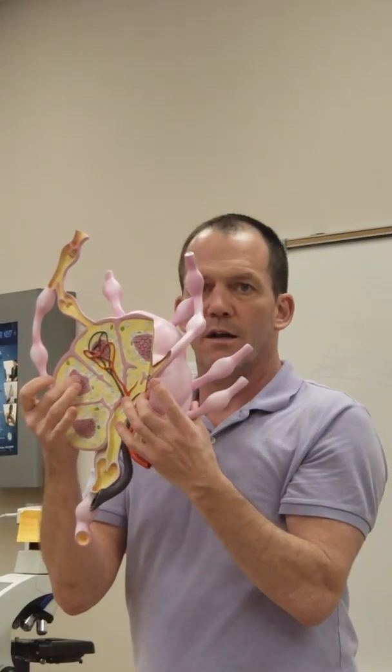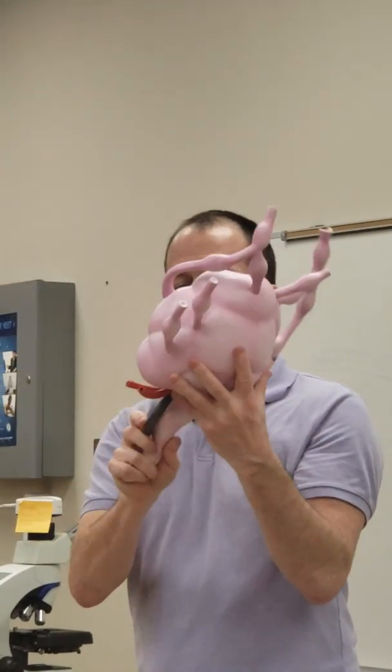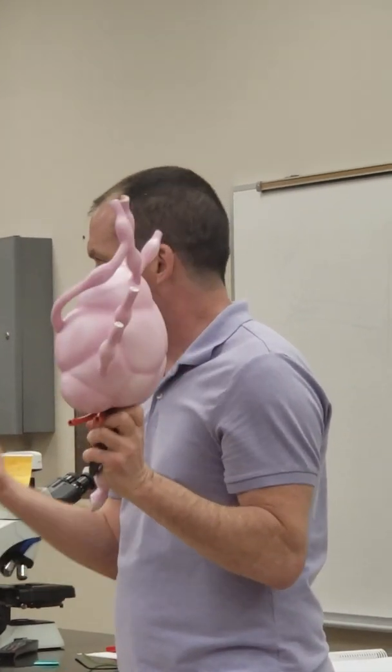These little nodules are germinal centers for various types of white blood cell. These are your main places to fight systemic infections. So if you get a bacterial infection, you get a lot of action in these lymph nodes. That's why mommy used to feel your neck when you were sick, to see if you had swollen lymph nodes. Maybe they didn't know exactly what they were feeling for, but when you feel big lumps in your kid's neck, you probably take him to the doctor. Excuse me, Mike, doctor's orders. Whoop, there you go.